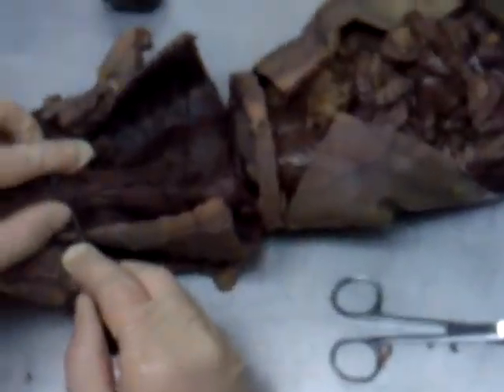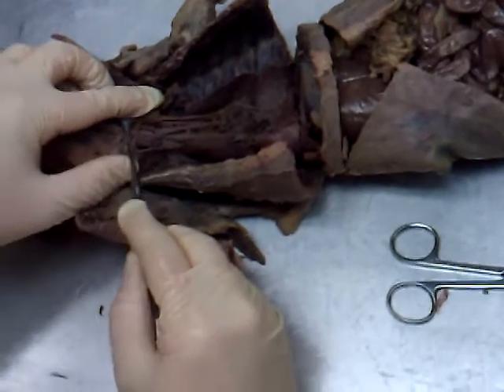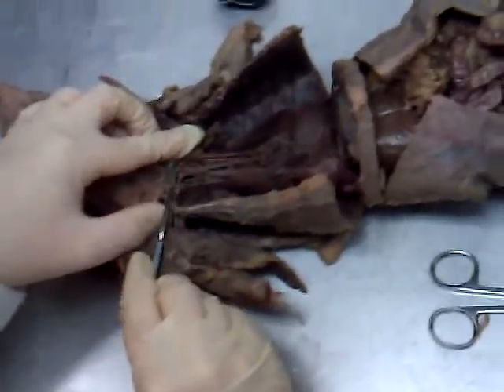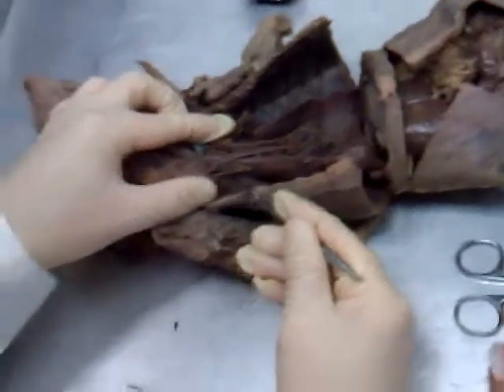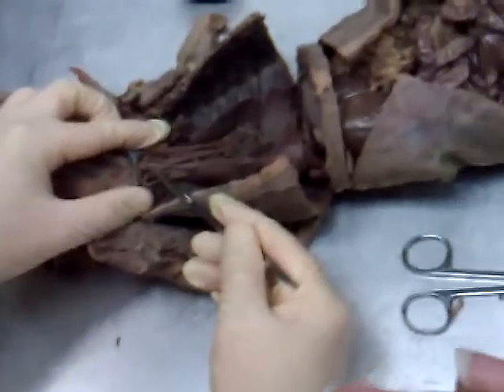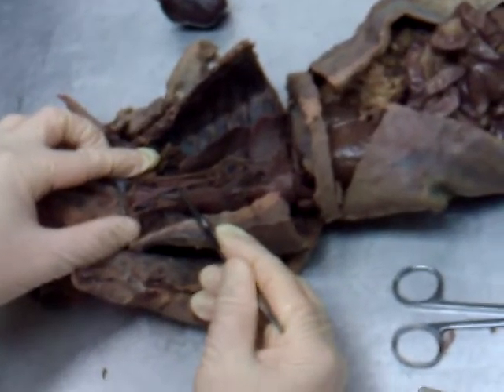Right in here was the left common carotid artery, and right here is the right common carotid. Going out to the mink's right arm, the last artery right in here is the right subclavian artery. So left common carotid, right common carotid, and right subclavian — all branching off of the brachiocephalic trunk.